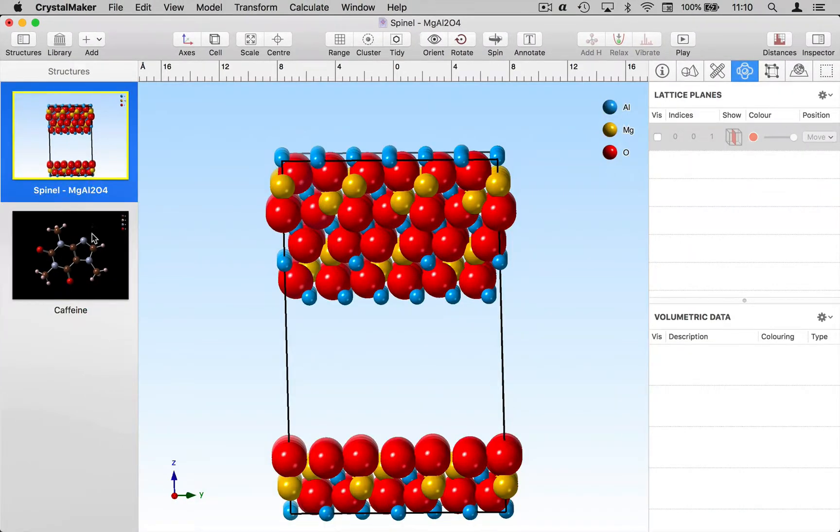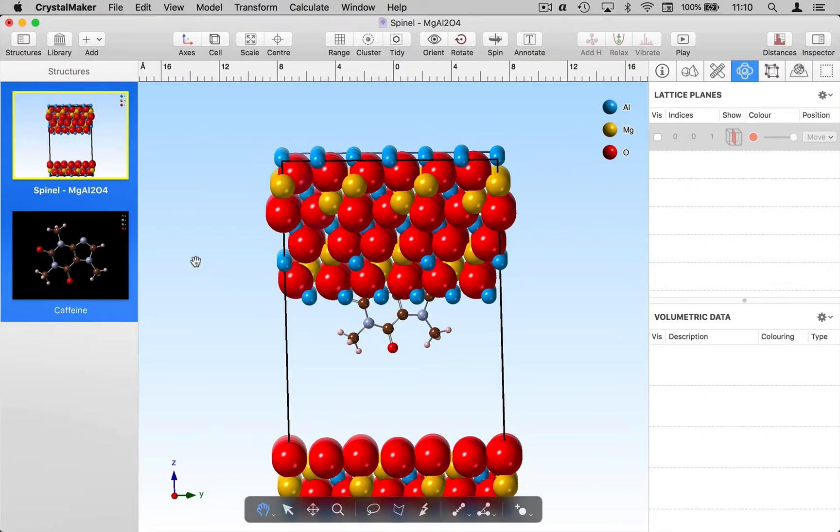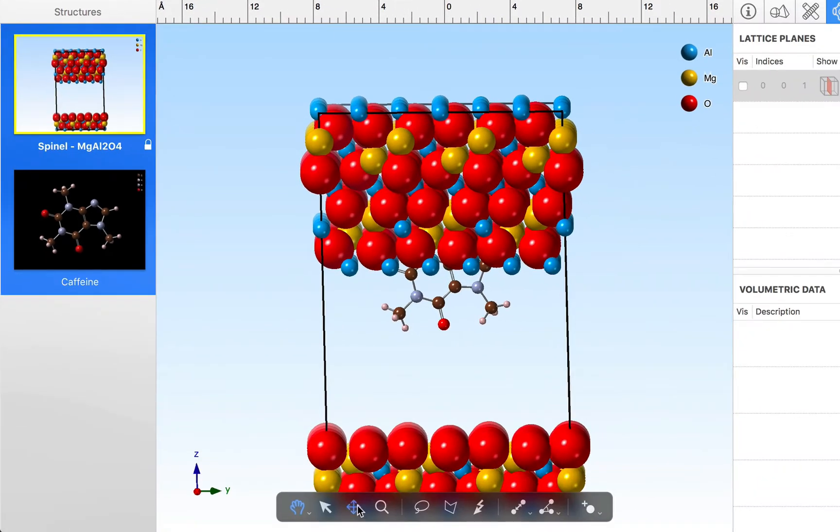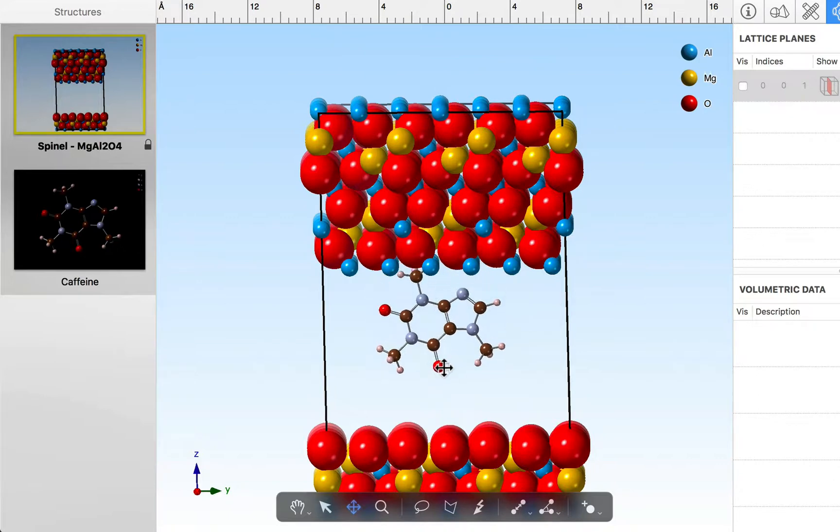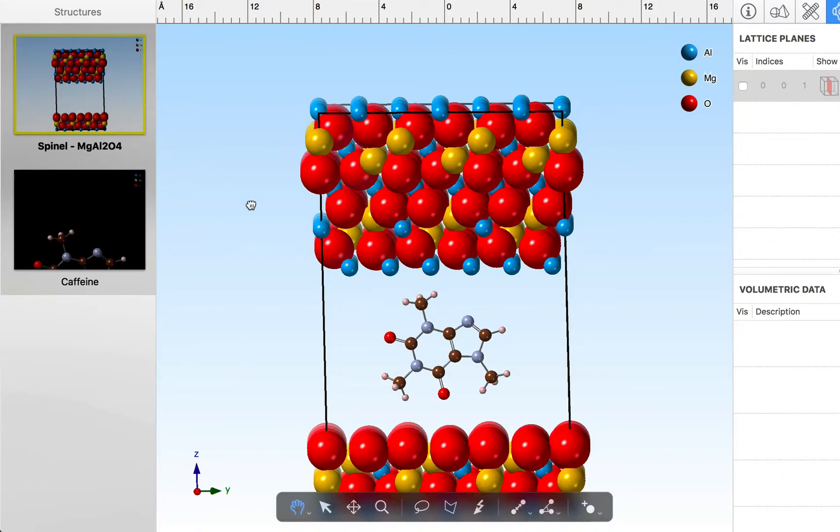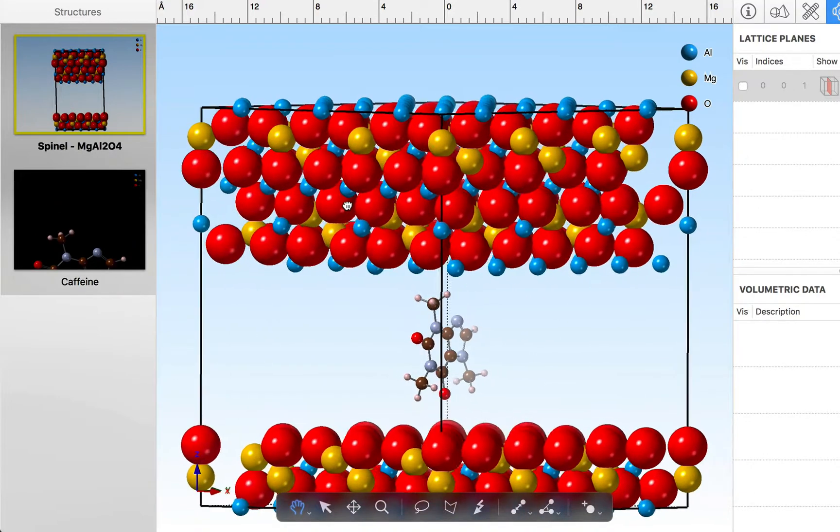Now if I hold down the shift key I can display the two structures in the same graphics pane and I can move one structure relative to the other by locking the host crystal and then by using the move tool let's move our molecule down to here. Okay so I've now got a display and if I unlock the crystal I can rotate the crystal and the molecule.